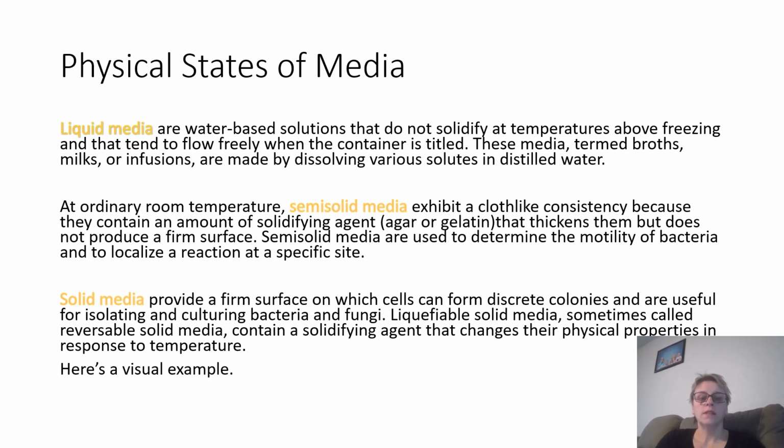Semi-solid media. At ordinary room temperature, semi-solid media exhibit a clot-like consistency because they contain an amount of solidifying agent, agar or gelatin, that thickens them but does not produce a firm surface.